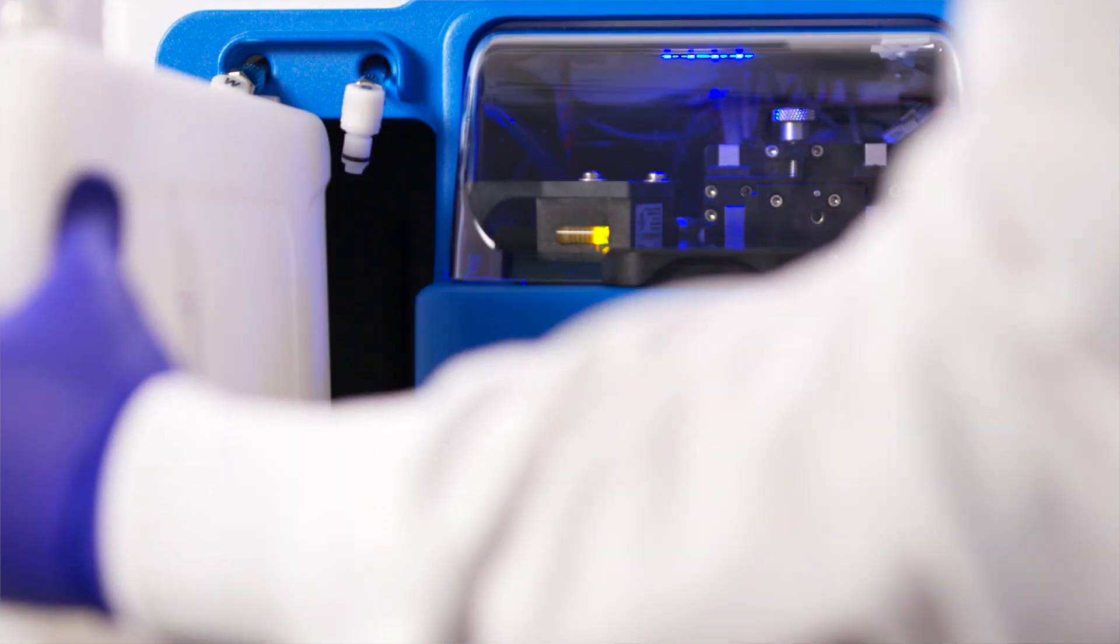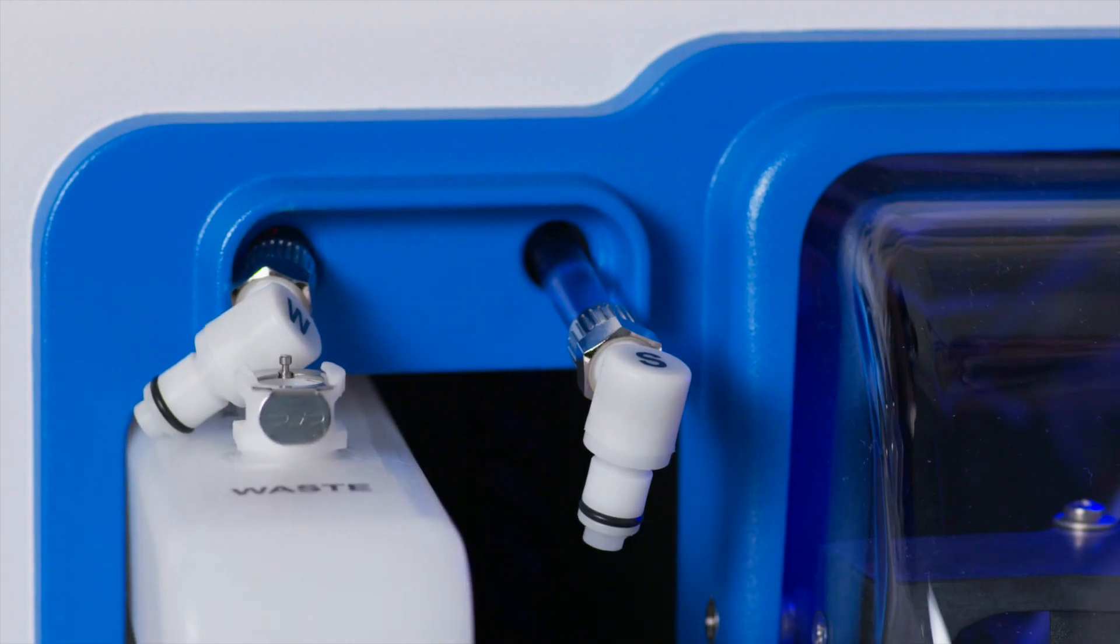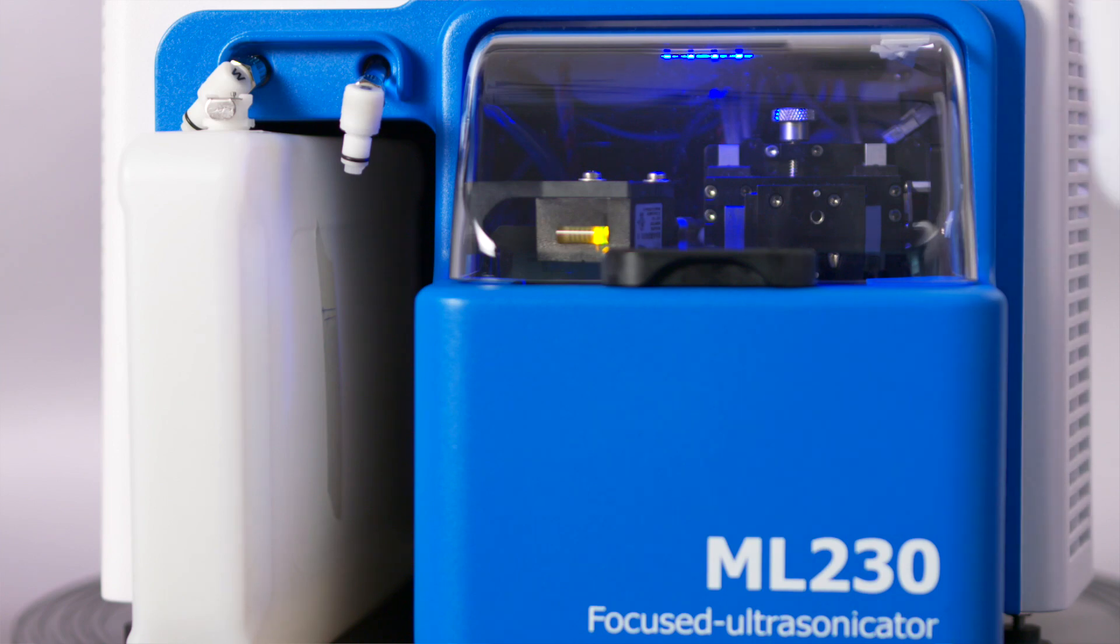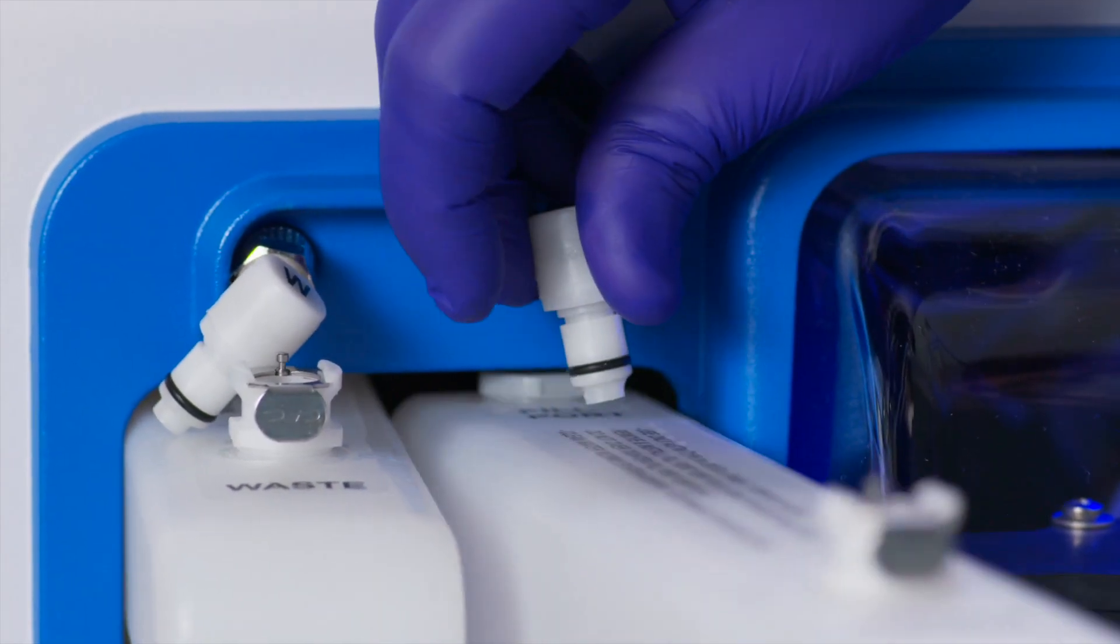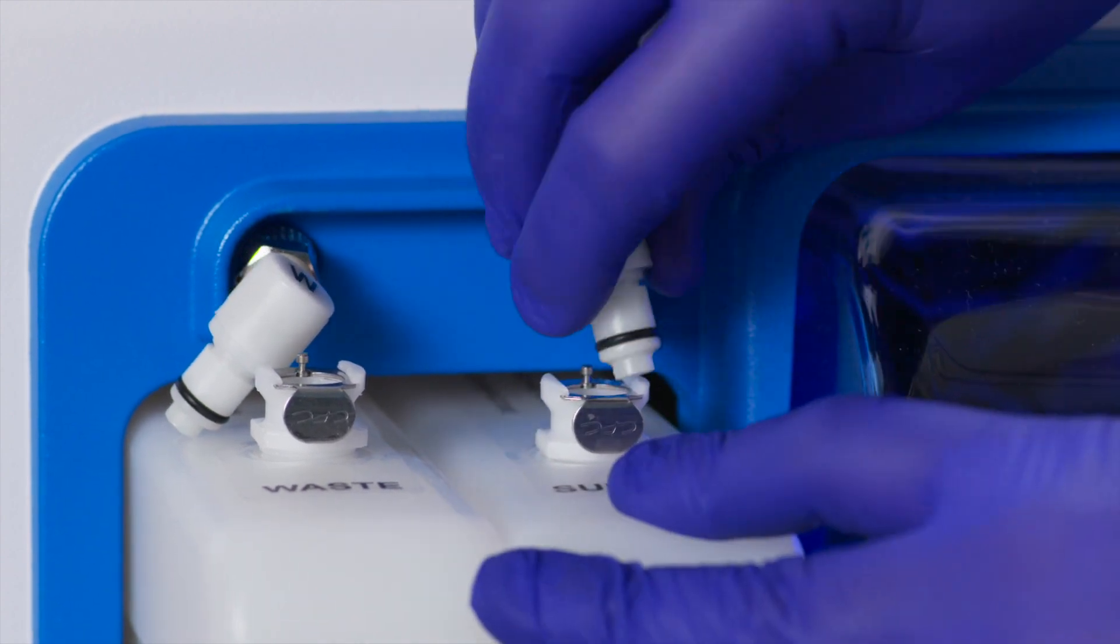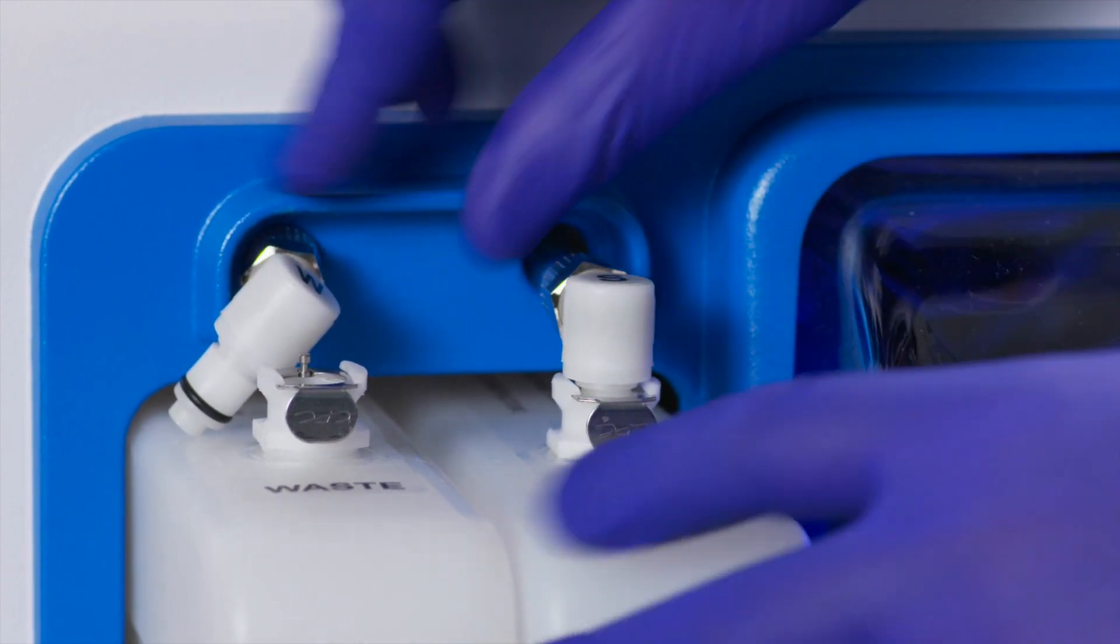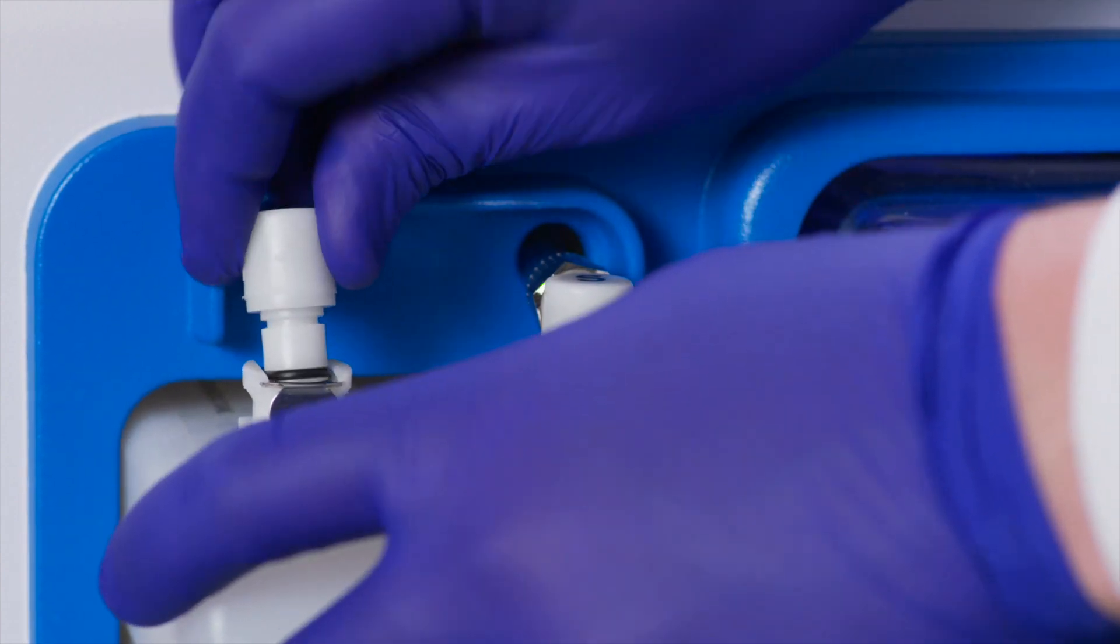Slide the waste bottle into the left side opening under the fitting marked W and slide the supply bottle, now filled with water, into the remaining opening on the right side under the fitting marked S. Press the fittings on both bottles until they click into place.